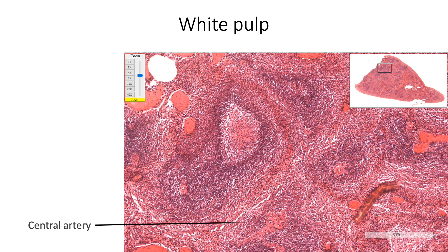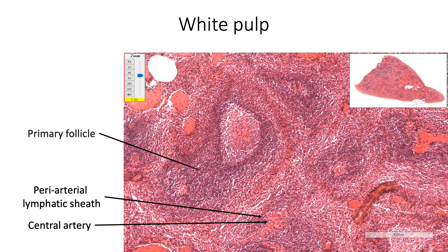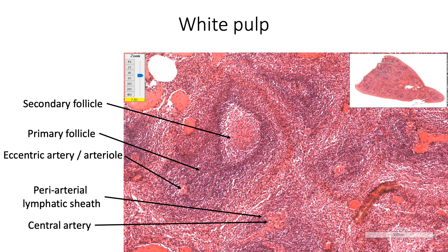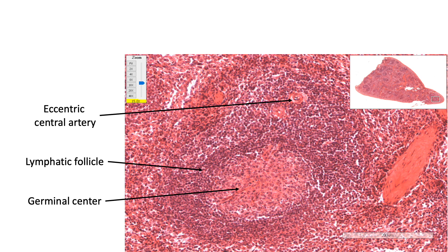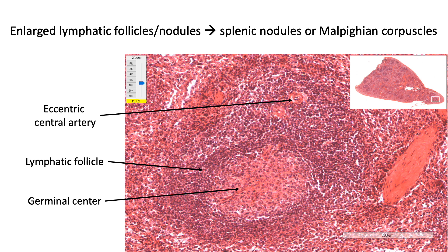White pulp is made up of the central artery whose tunica adventitia is replaced by the periarterial lymphatic sheath, which is predominantly made up of T lymphocytes. When the B lymphocytes in the white pulp proliferate to form either a primary or a secondary follicle, the central artery acquires an eccentric position. Here we are seeing the lymphatic follicle with the germinal center and an eccentrically positioned central artery. These enlarged lymphatic follicles or nodules are called splenic nodules or Malpighian corpuscles, not to be confused with the Malpighian corpuscles of the renal cortex.